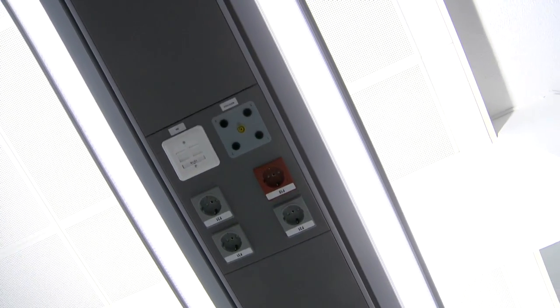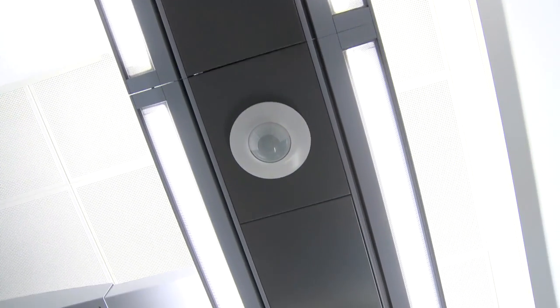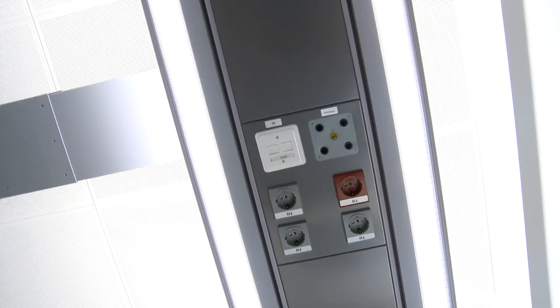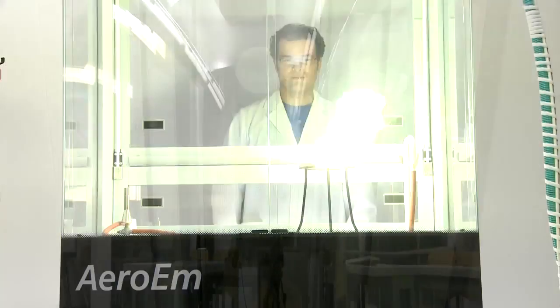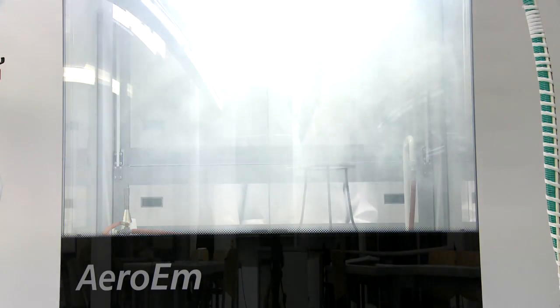The use of aluminum, which requires a great deal of energy to produce, has been significantly reduced. The patented lighting system can be enhanced with sensors in order to reduce electricity consumption for lighting, thereby cutting CO2 emissions.